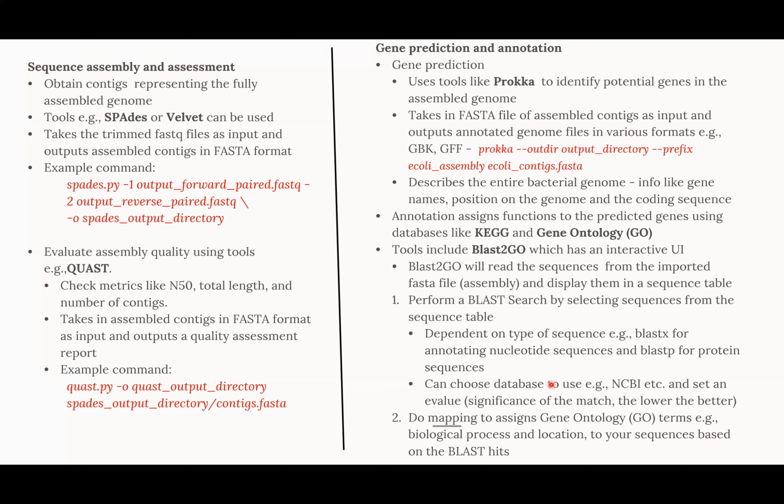It's like a search for your genes against the database. At this point, you can choose NCBI or another database that you desire, like UniProt if you have protein sequences. And then you have to set an e-value.